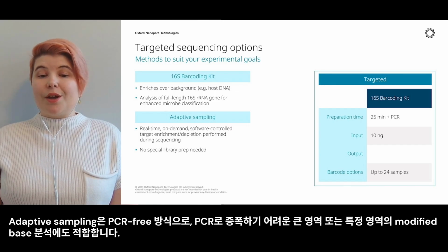As this method is PCR-free, it is particularly well suited for sequencing large or difficult to PCR regions, as well as for exploring base modifications.